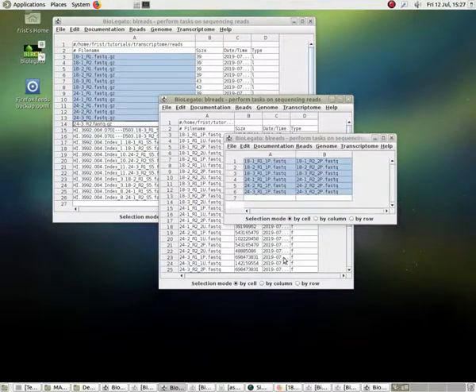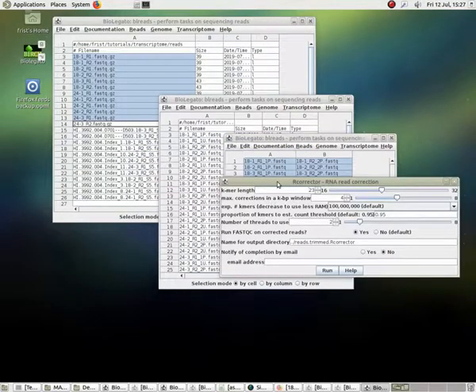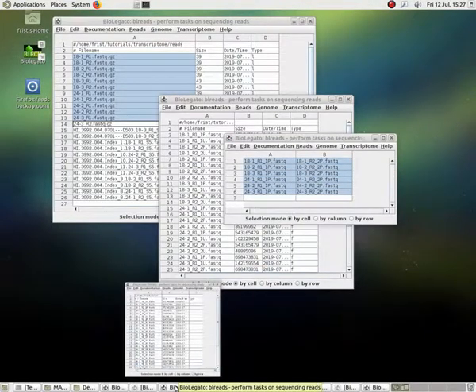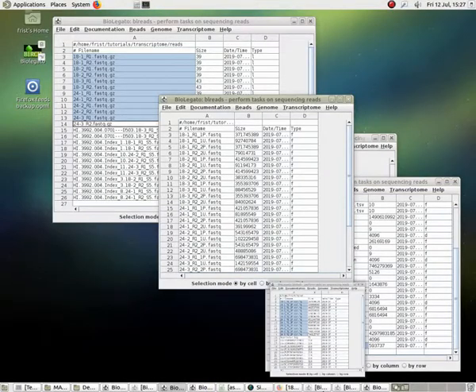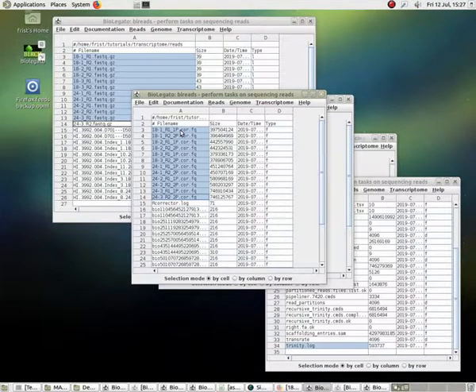And so now that I've got the paired reads from Trimmomatic for the trimmed reads, I can correct the reads using rcorrector. This is a program that is specific for correcting RNA reads. I've already run rcorrector, by the way, so I happen to have the output. There is the output for rcorrector, and now all of the files have a .cor.fq file extension.